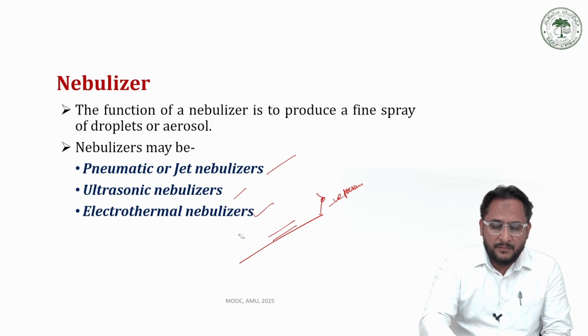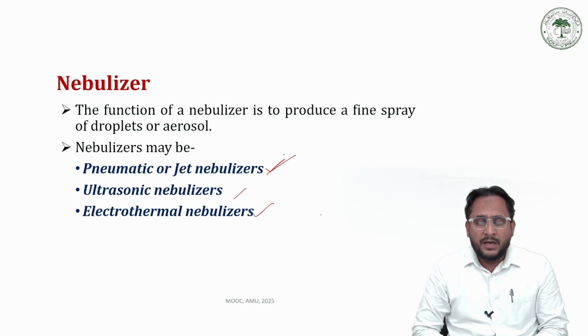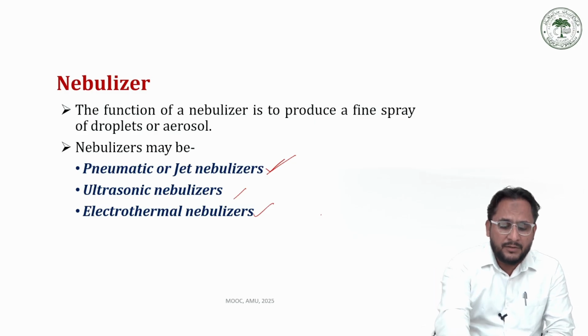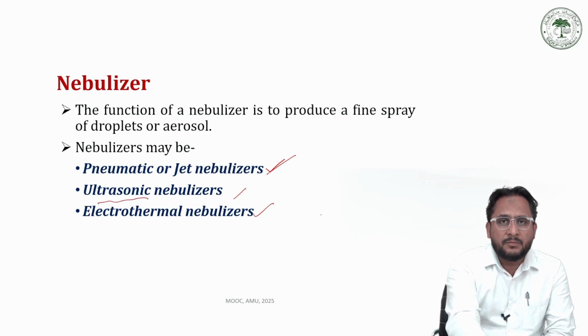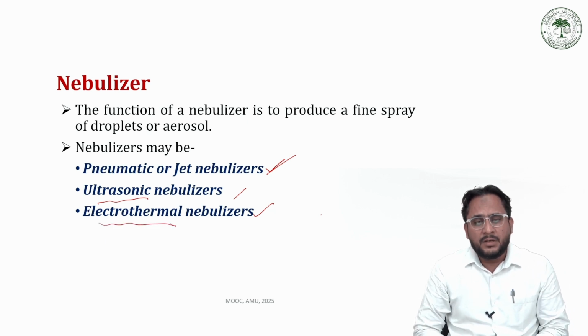The same nebulizer is utilized in AES as well, and these are called pneumatic or jet nebulizers. In addition to these pressure based pneumatic or jet nebulizers, we have a choice of two more types: the ultrasonic nebulizers, which are based on ultrasonic waves, and the electrothermal nebulizers.